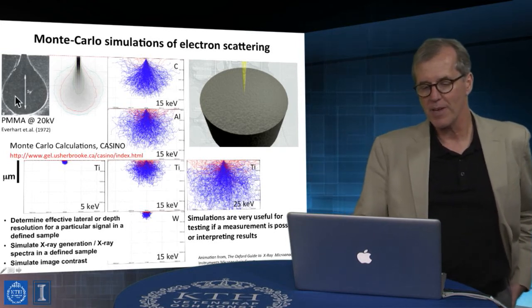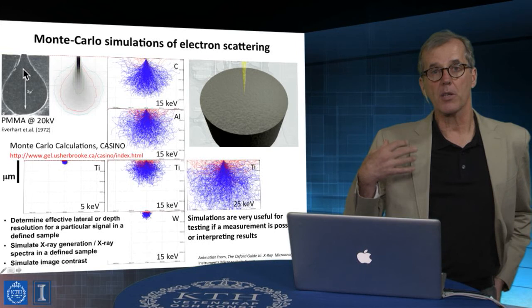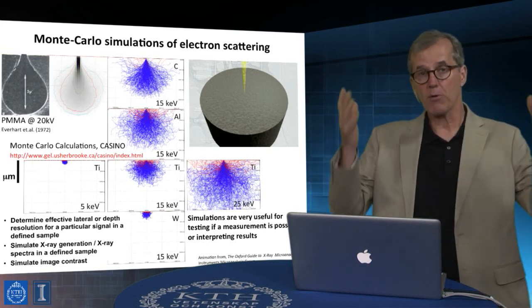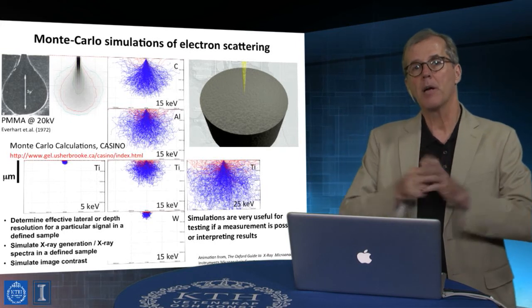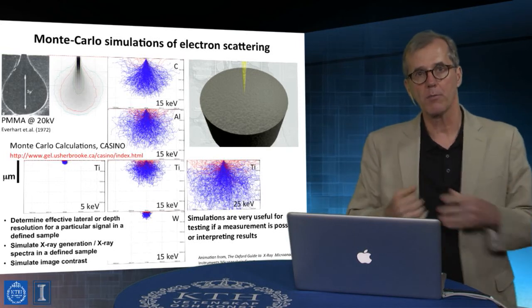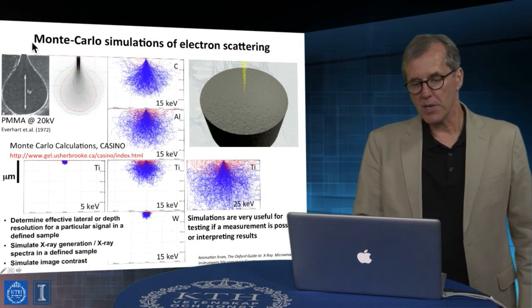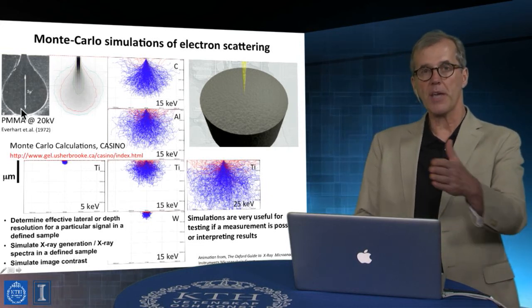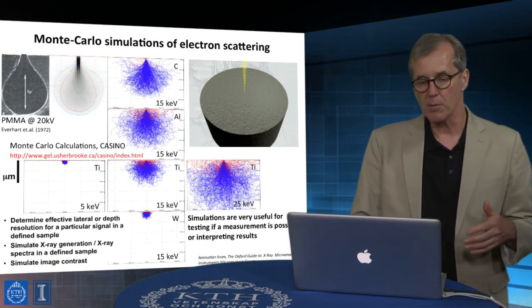But for this experiment, it has a really peculiar characteristic, and that is radiation tends to make the macromolecule fall apart. What happens is you break carbon-carbon bonds, and the polymer unzips. It just reforms the monomer from which it was synthesized. And in this way, you can actually look at where material was lost and image the places where the excitations are sufficient to induce the breakage of chemical bonds.